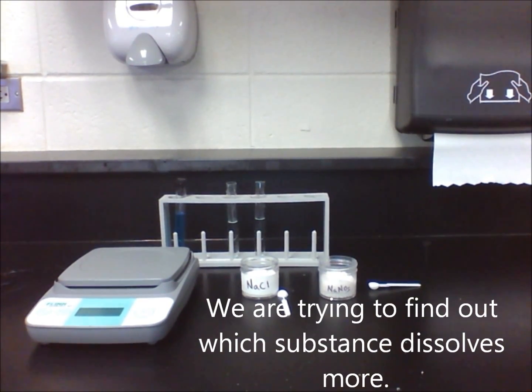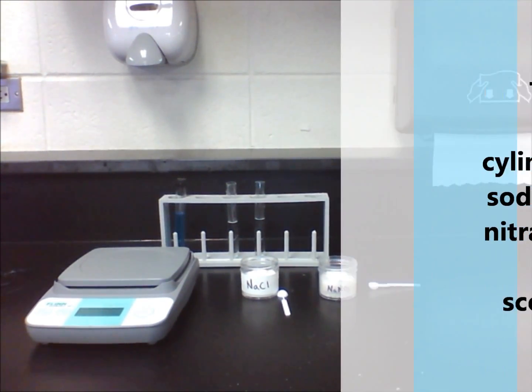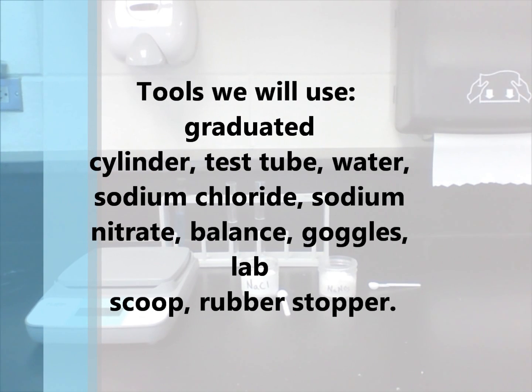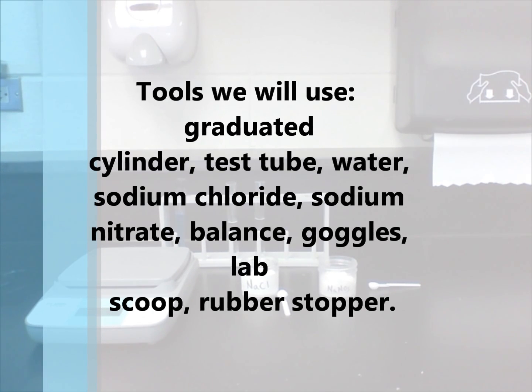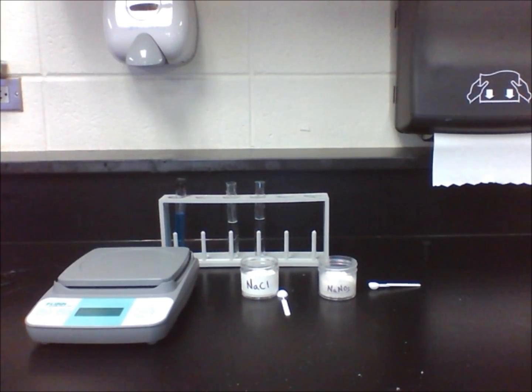We will know when we have a saturated solution when the solute is unable to dissolve any more in the given amount of solvent. We will calculate the amount dissolved by subtracting the new mass of the jar from the original mass of the jar. We are going to find the solubility of salt and sodium nitrate, which substance will dissolve more in equal amounts of water.